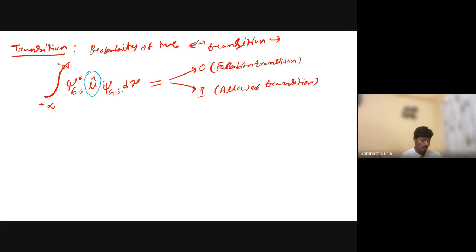So first of all, thinking about the optical activity, that means we are talking about the UV-visible region, whether the light is absorbed or not, or the light-matter interaction in the UV-visible region. This is associated with the light absorbance by the molecules.